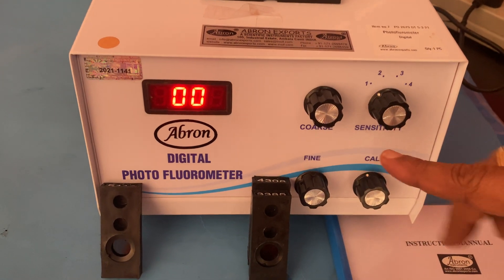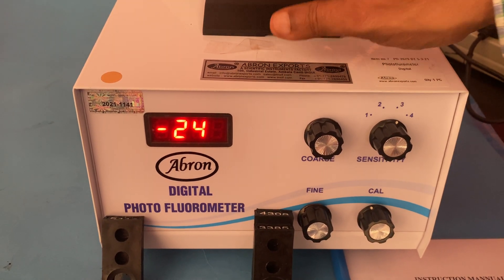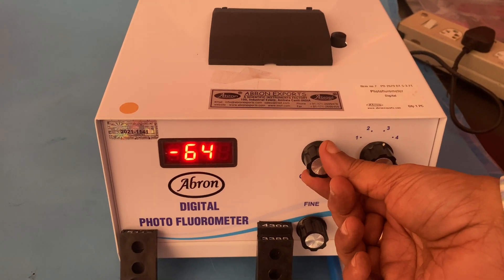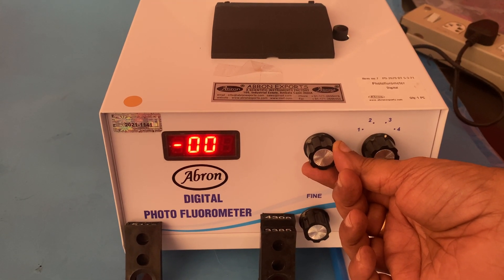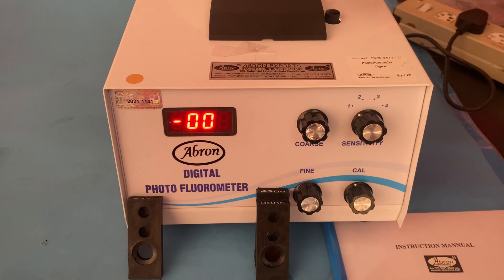There are three or four methods. I set sensitivity to three. Put in the blank sample and set it to zero. The setting is zero — confirmed it is zero. Then I put it back and press.